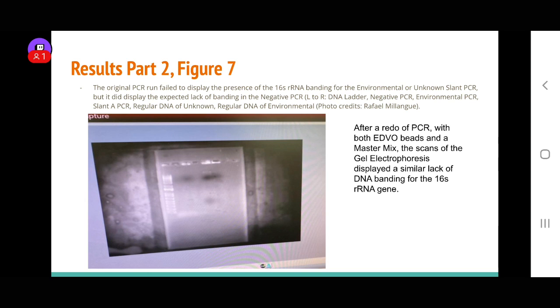It would have been near the top of the gel, since larger fragments of DNA don't travel toward the positive end in the electric field as easily as smaller fragments. We did not see a band at the top for wells 3 or 4. Those were the wells that had the bacterial PCR solutions in. We count from left to right.